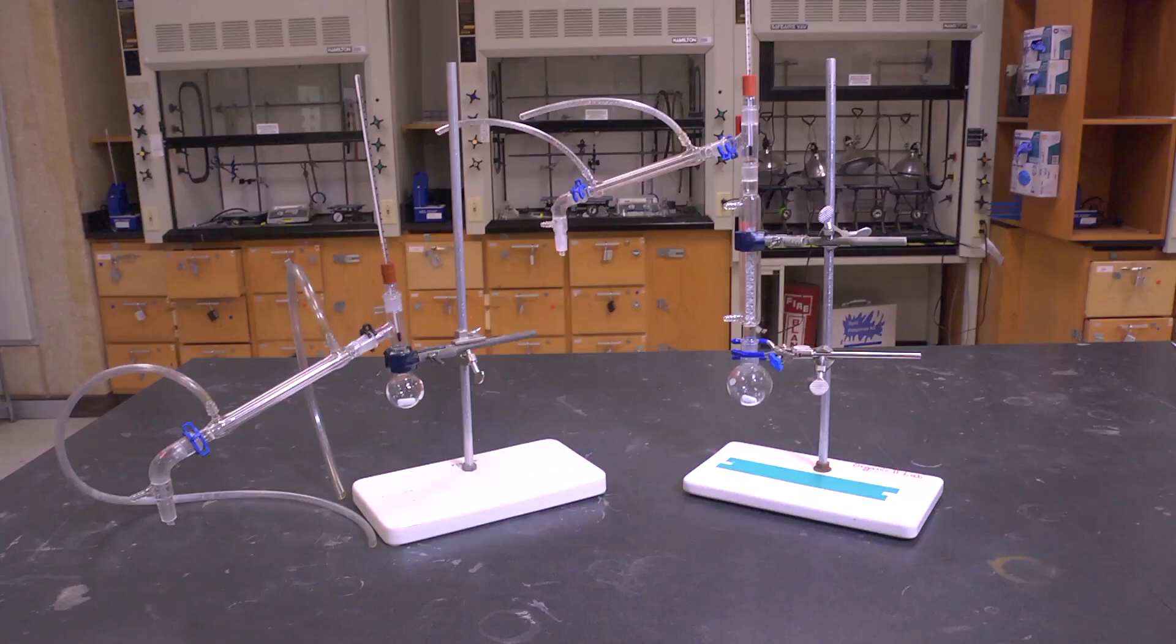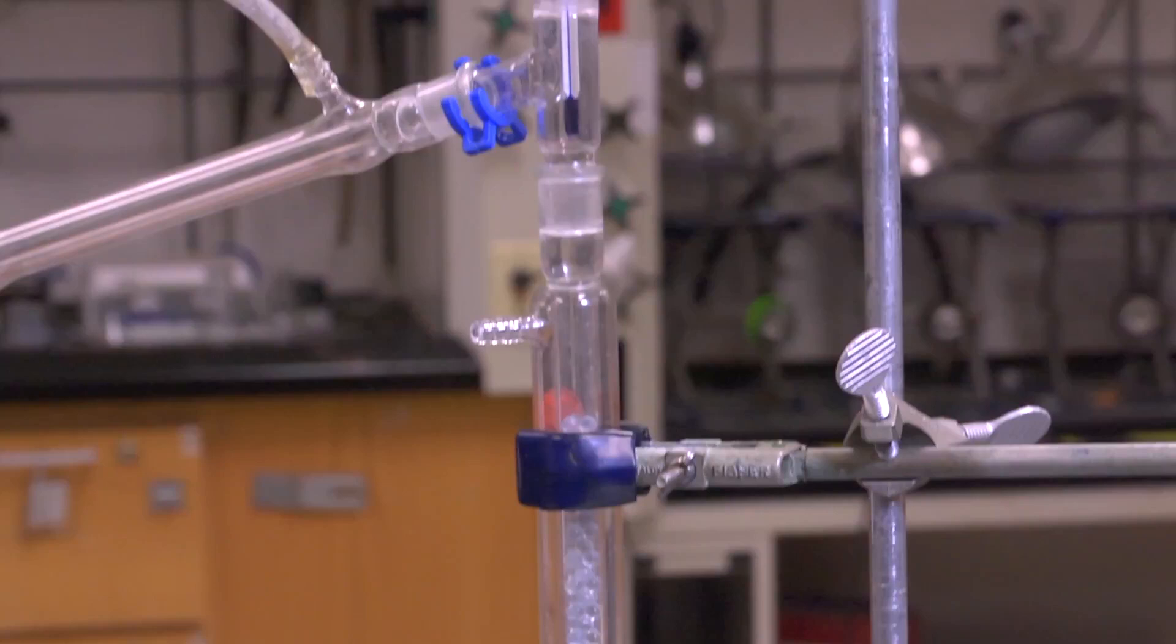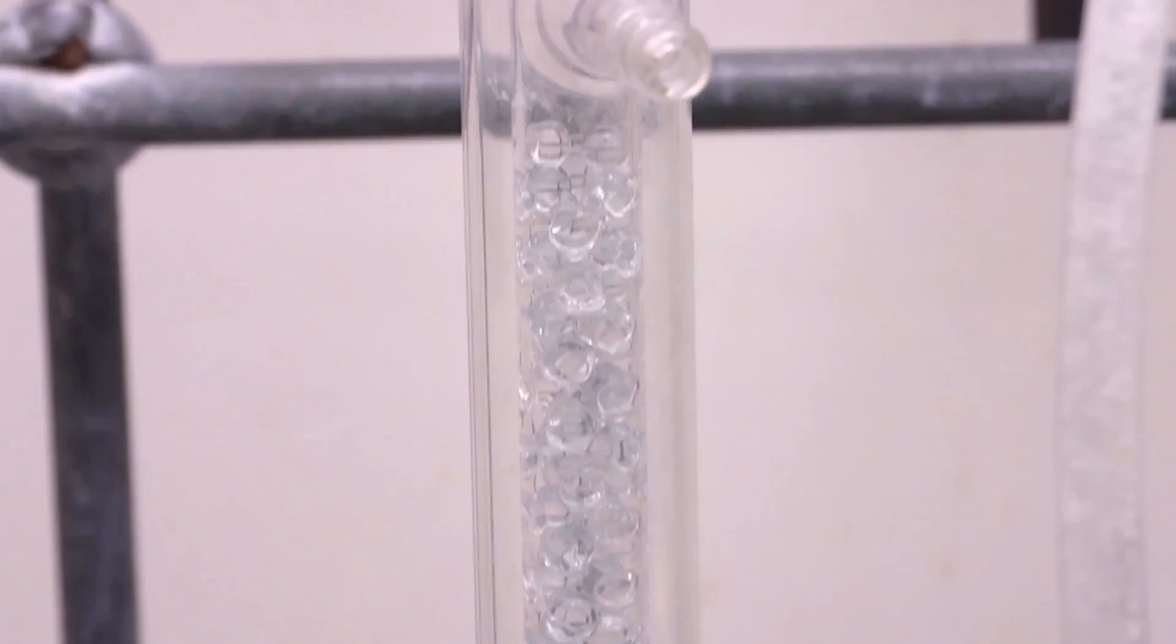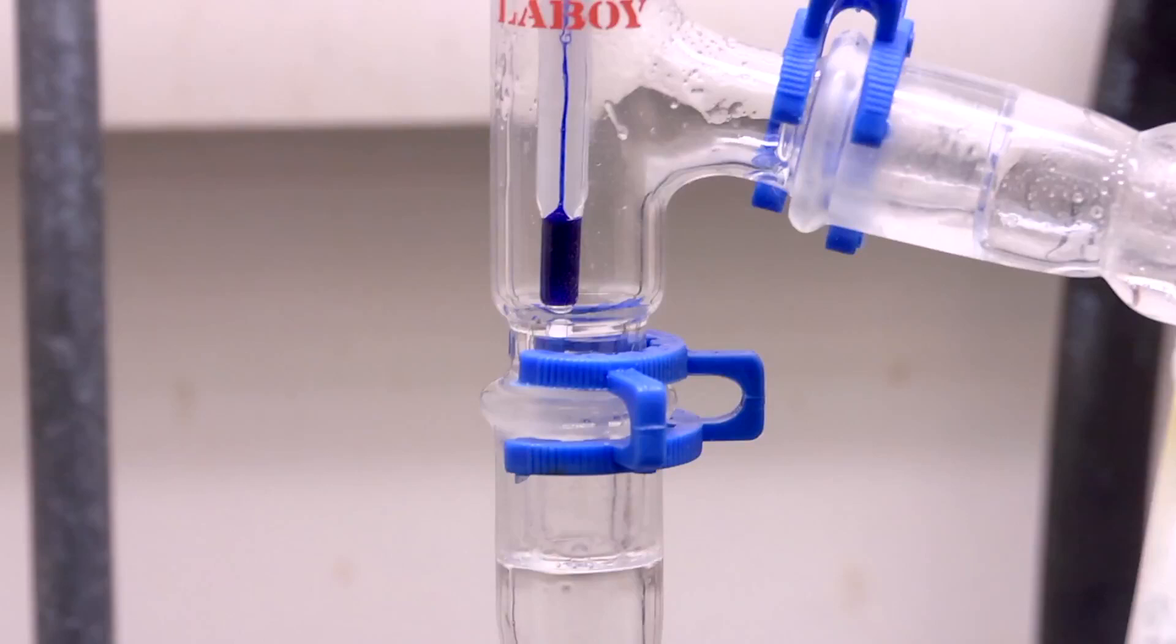Fractional distillation incorporates the use of glass beads and can be thought of as many separate mini-distillations that increase the purity of the distillate. For fractional distillation, the liquids do not need to have large boiling point differences. As the temperature rises and the mixture starts to boil, condensation will collect on the beads and fall back down.